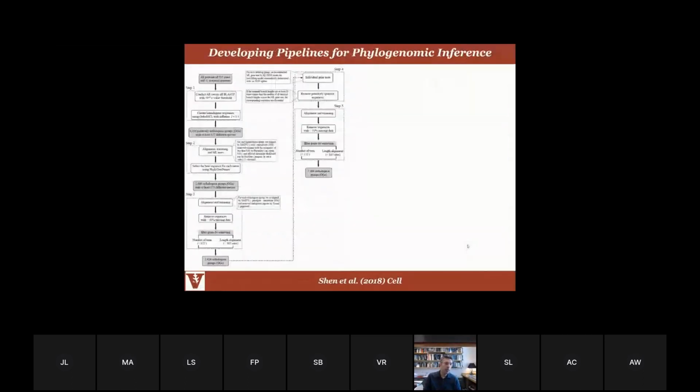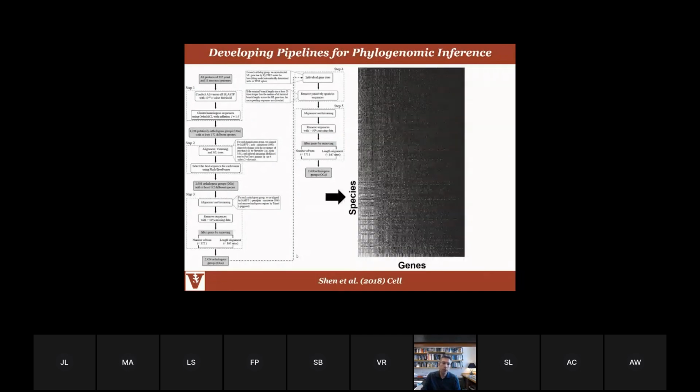We also had to come up with something else. Once we generate the genomes, we want to identify orthologs and gene families from these genomes, and be able to infer the evolutionary histories of genes as well as of the strains at hand. So we had to develop quite elaborate pipelines for identification of orthologous genes, and there has been continuous tool development by our group in developing these methodologies.